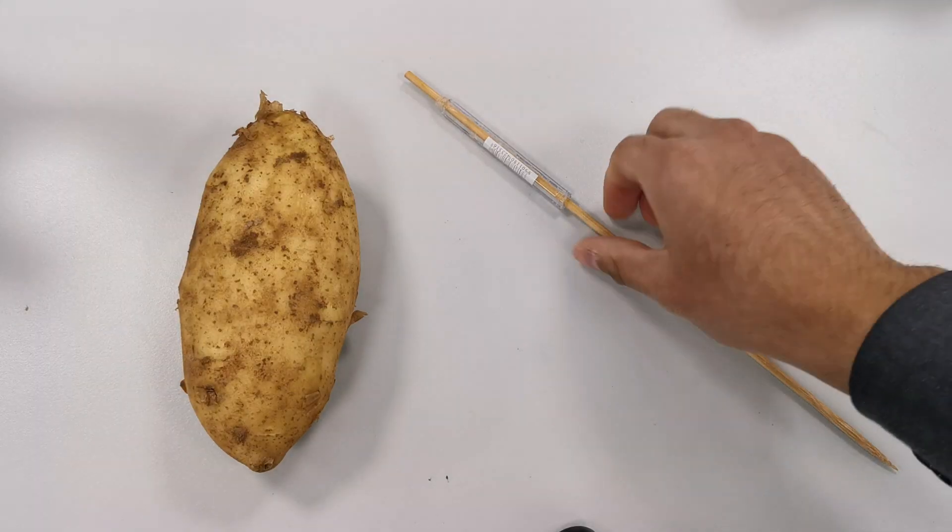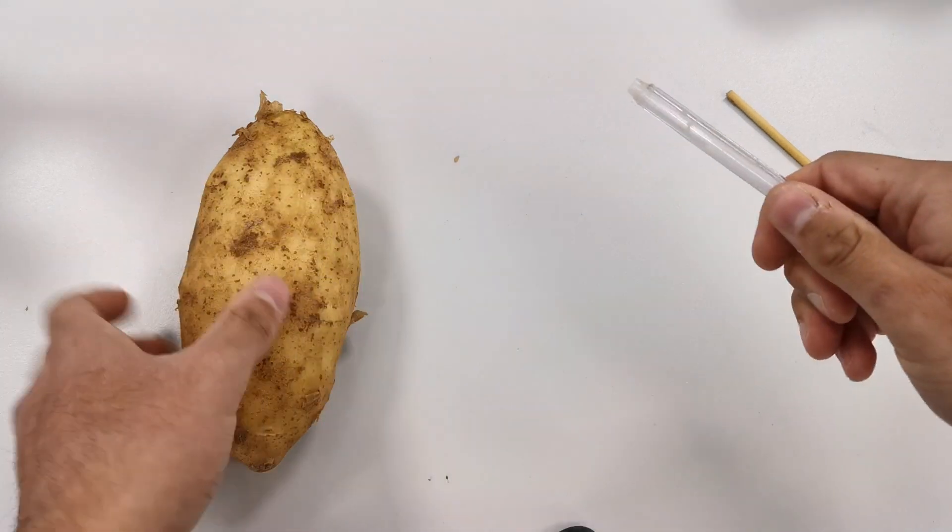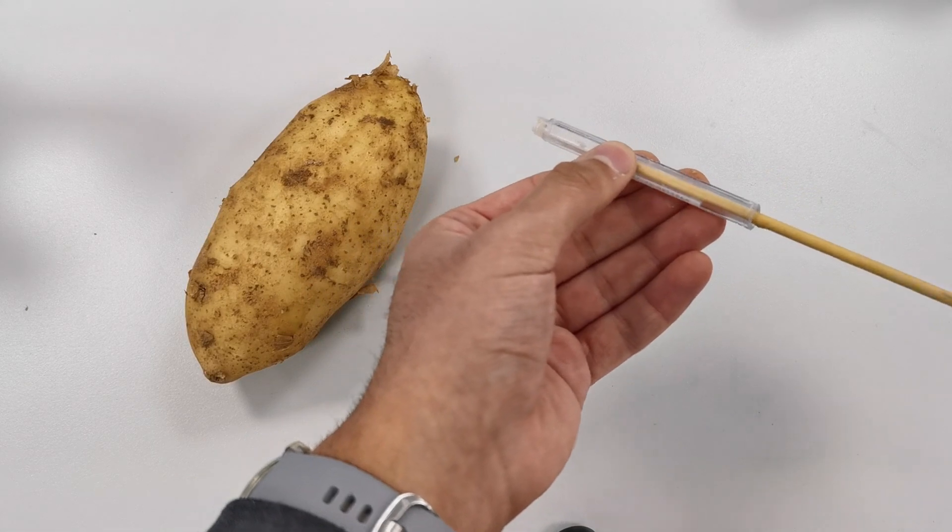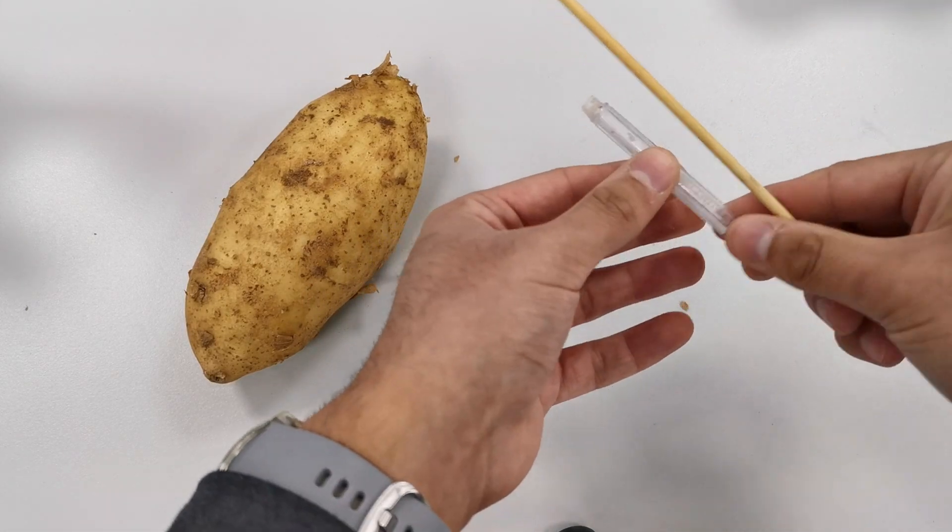We're going to start by pushing the potato borer through the potato to make a cylinder and then removing the potato cylinder from the borer by using the stick to push it through.